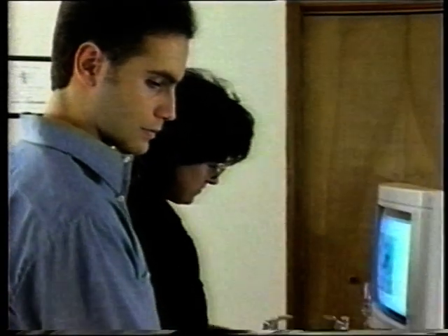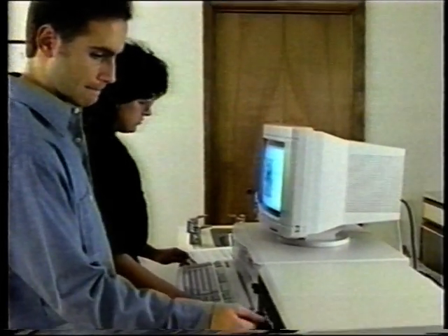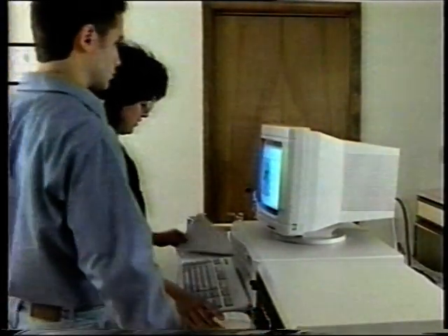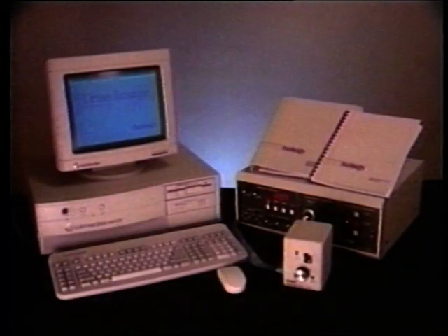The response from students was overwhelming, and the teaching value of STM became dramatically apparent. Based on the University of Rochester's experience, a project was initiated to develop an STM that was specifically designed for students and first-time industrial users who would benefit from this powerful new technology. Burleigh Instruments is proud to have developed the Instructional STM.